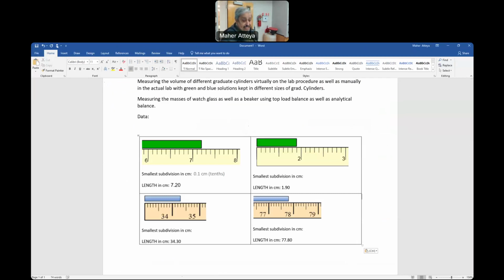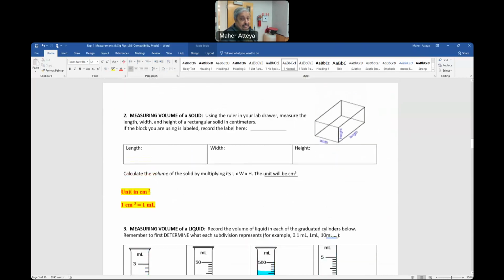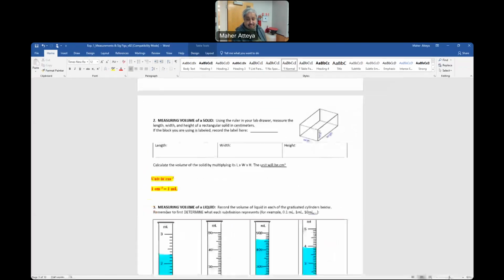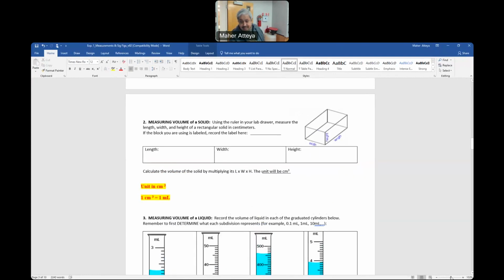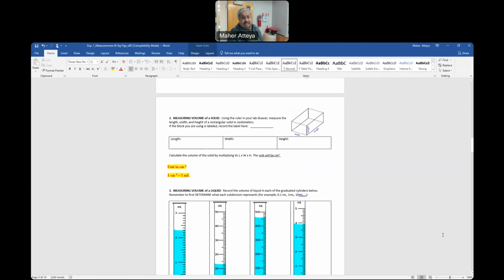Next I come to the next one here. We did this one here, correct? I did not measure those. You have to have it 100%. So suppose this is 99%, so 32. That's 100%. So I did this measurement here. Then what I will do, I'll just come here. I don't have to write all of this here, but I will say a new one.